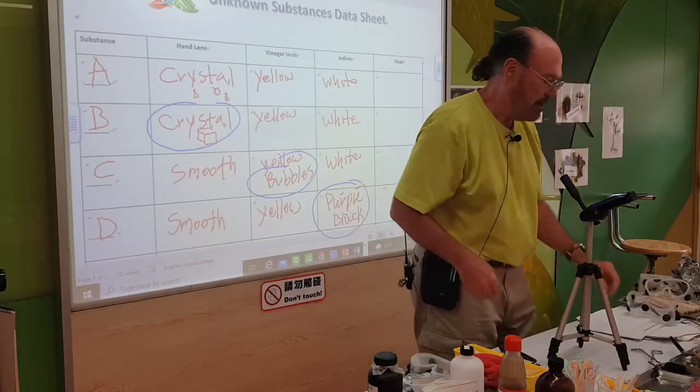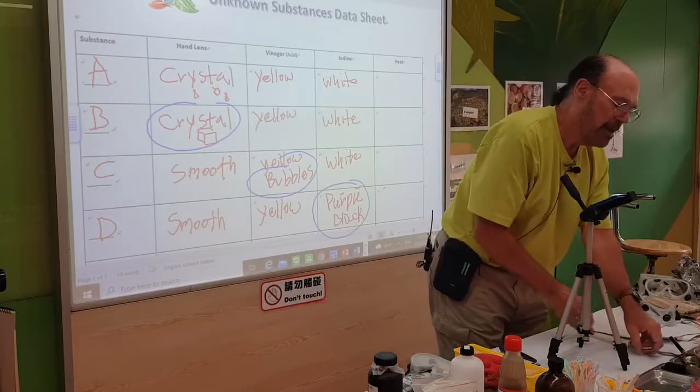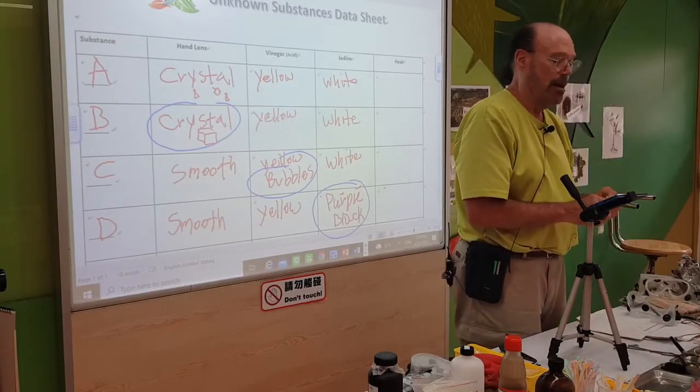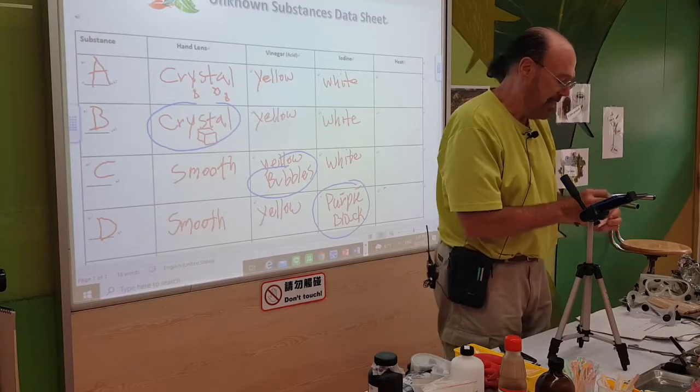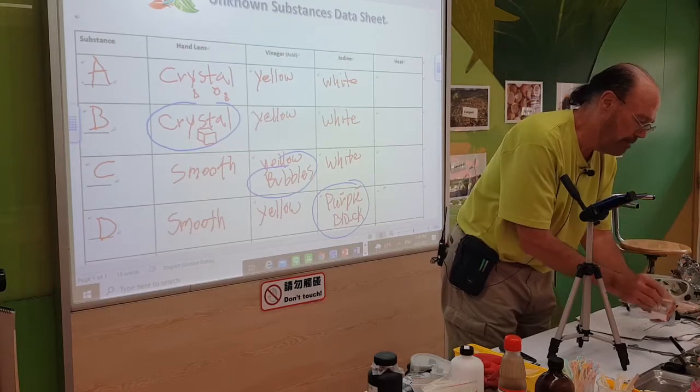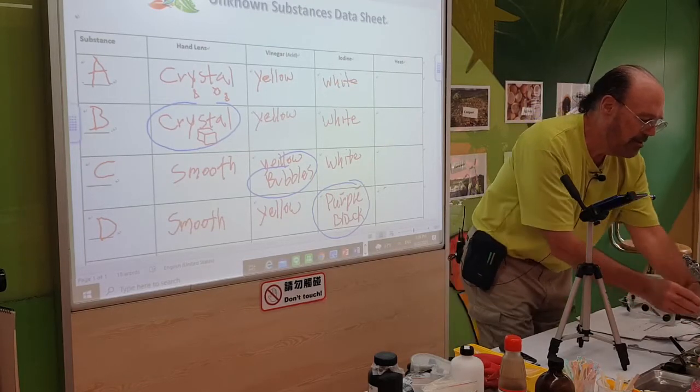So what I'm going to do is not test all the substances. I'll just tell you ahead of time, B, C, and D, there's really no change. So I'm going to take a packet and put A in there because A is the fun one.